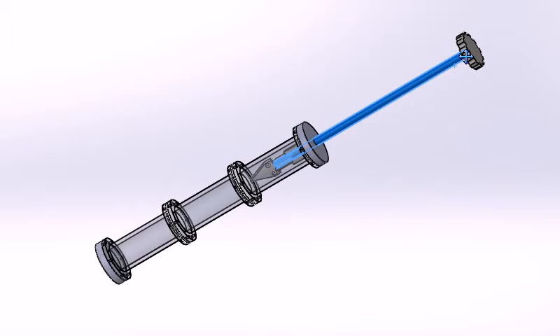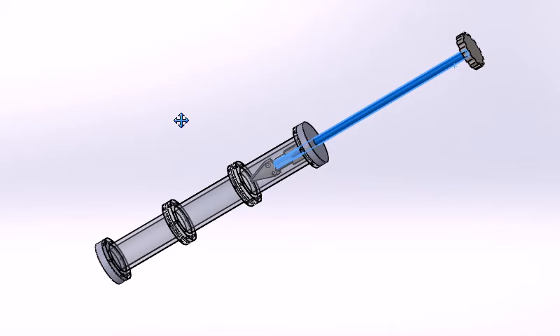So that's it. This I think would serve the purpose of making it simple and effective. I think it's a little bit easier than what they did on the ISS. We do have to machine 30 of these containers to make that happen, but it takes out a lot of the guesswork and additional components that NASA used during their studies.